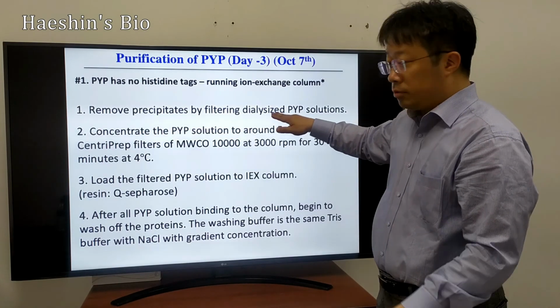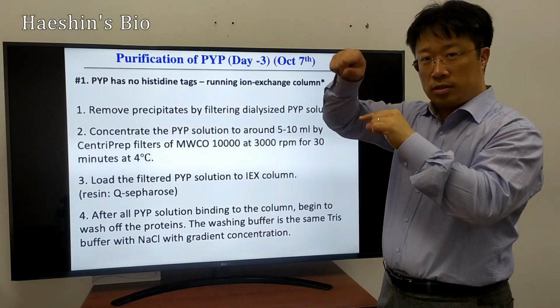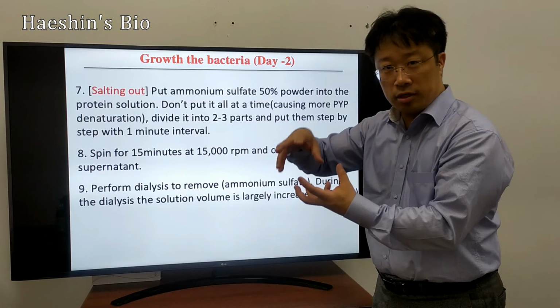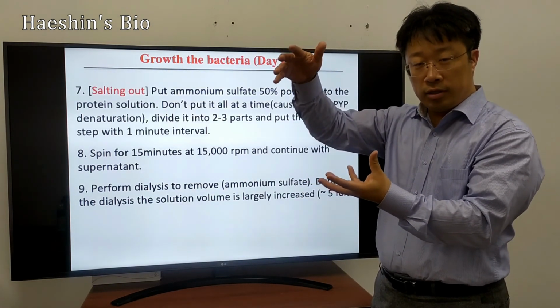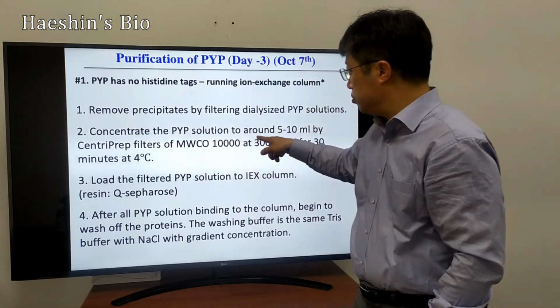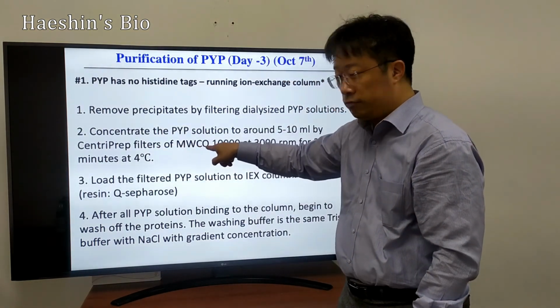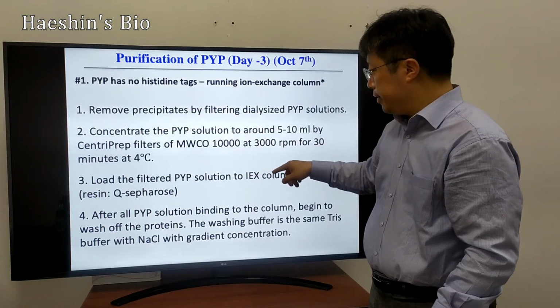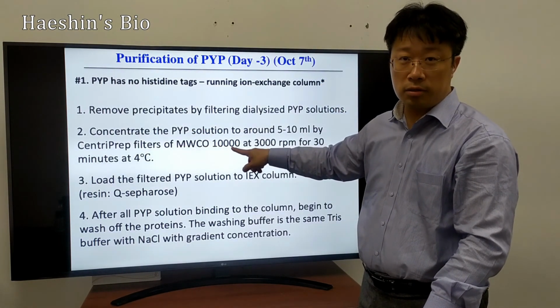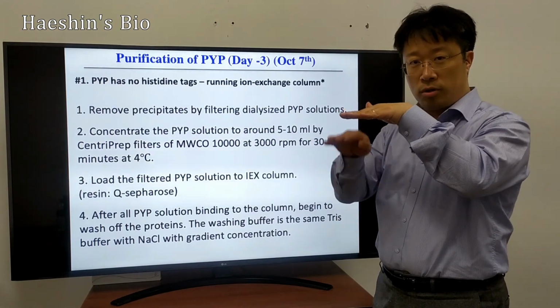So now, in the previous step, we had a dialysis of the solution, and the PYP, the target protein, is inside this bag. And then, as I mentioned before, this volume is increased. 15 milliliters becomes 30 or 45. So to handle it properly, you have to reconcentrate the solution again. So concentrate the PYP solution to around 5 to 10 milliliters by using a filter that has a molecular weight cutoff. This is the cutoff size. It's about this size. So then, the molecular weight of PYP is above 10,000 dalton. So then the membrane with molecular weight cutoff of 10,000 will retain it on top, and then anything that is lower than 10,000 will go down.